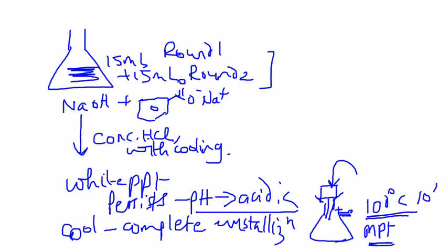So what you're going to report is the melting point and the grams, so percentage recovery. The way you would figure out the percentage recovery is whatever grams you get divided by the 2 grams that you began with, times 100. So this will give you a number. This number plus the percentage recovery for naphthalene plus the percentage recovery for the EPAB must add up to 100%, to make the total 2 grams.